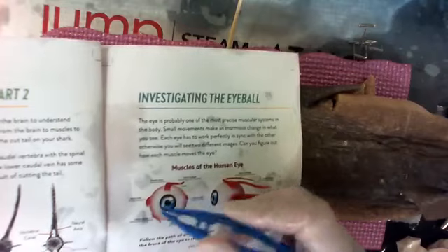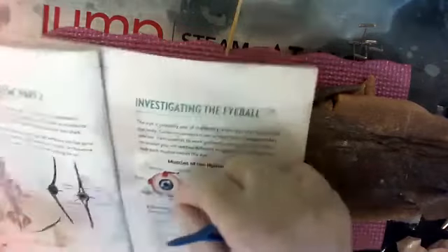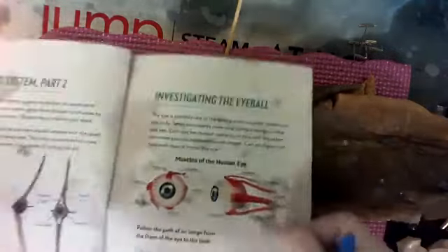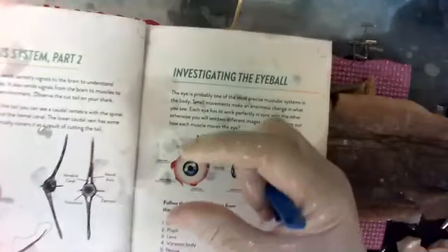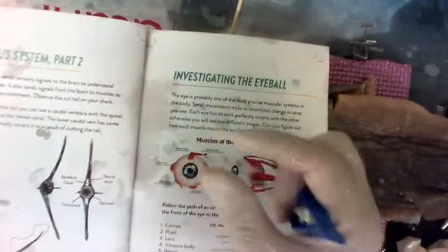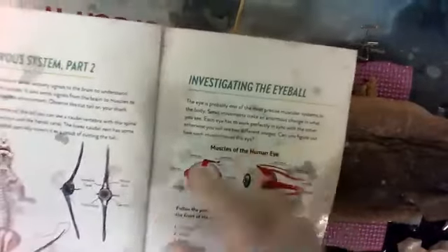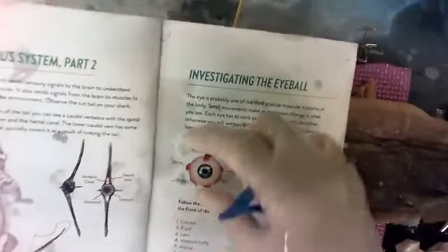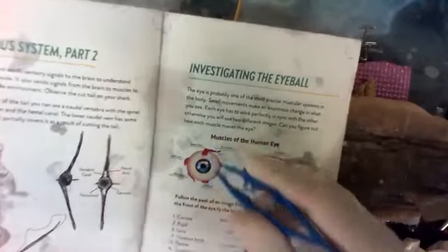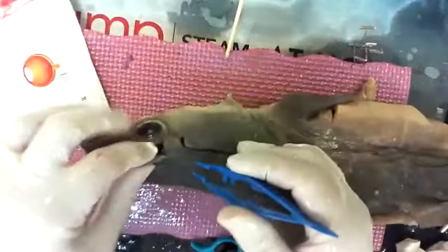The ones to the side are obvious because when you pull on it, it's like a puppet. You pull this side and it turns the eye one way. The other way, up, down, right? But these ones that go crooked actually spin the eyeball a little bit. It rotates it, which we don't think much about, and we don't use that very often unless we're falling, really. But it can give it a little bit of rotation. It's pretty cool. So these muscles are what I was getting at.